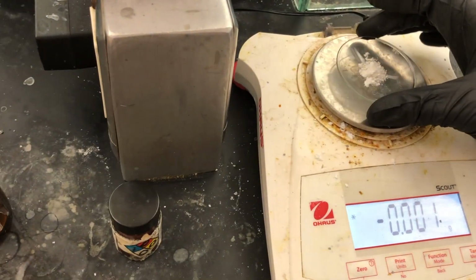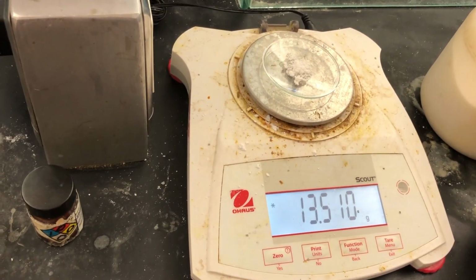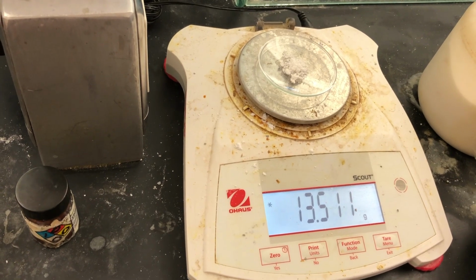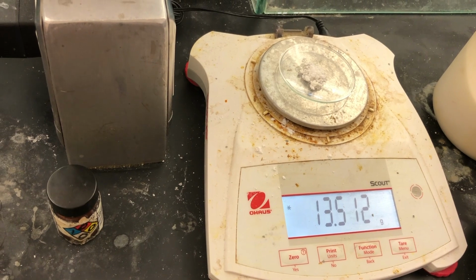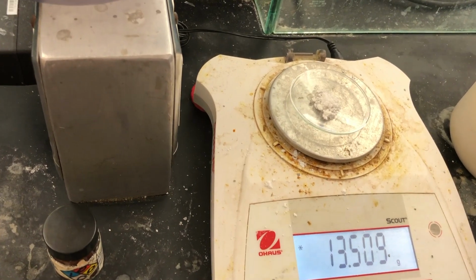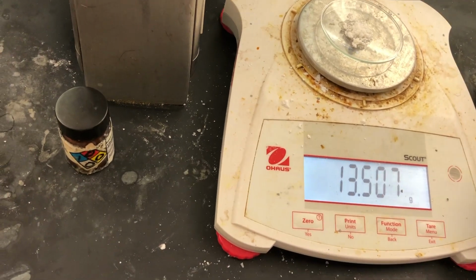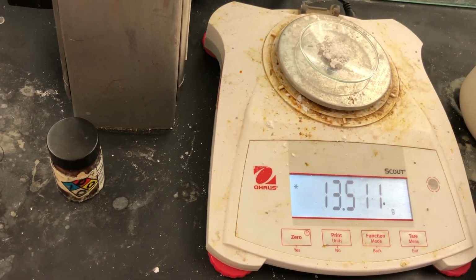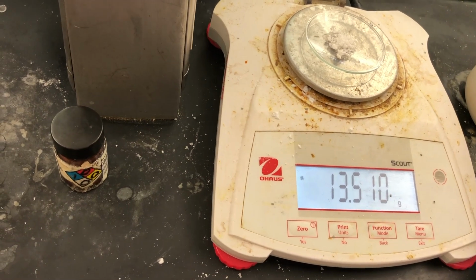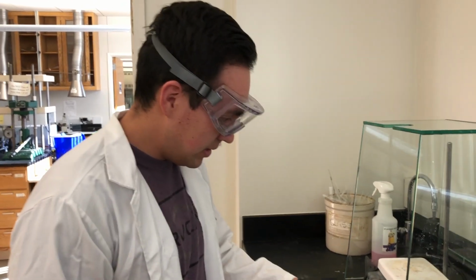Okay, so now we're going to weigh the salicylic acid. It's about 13.511. The watch glass weighs 13.347. So take the difference there. It's about almost 200, 150. And that's going to be our starting material for the next step, step 2, to make acetylsalicylic acid. Okay, we're going to start on step 2 of the aspirin synthesis.